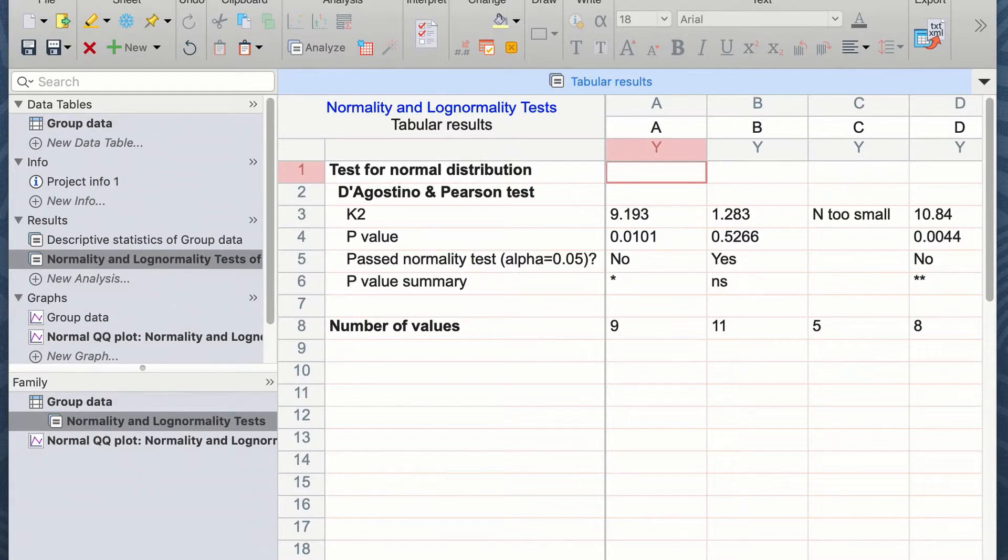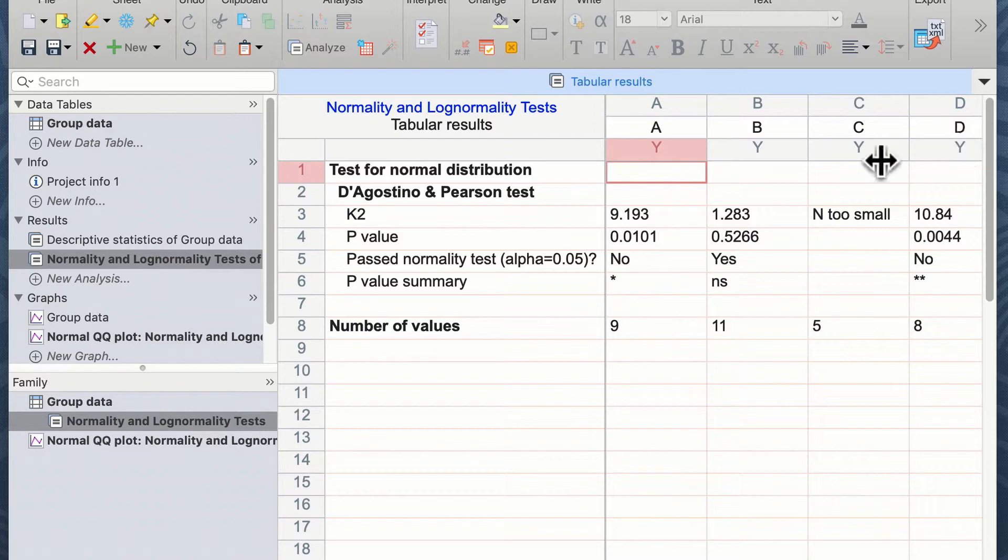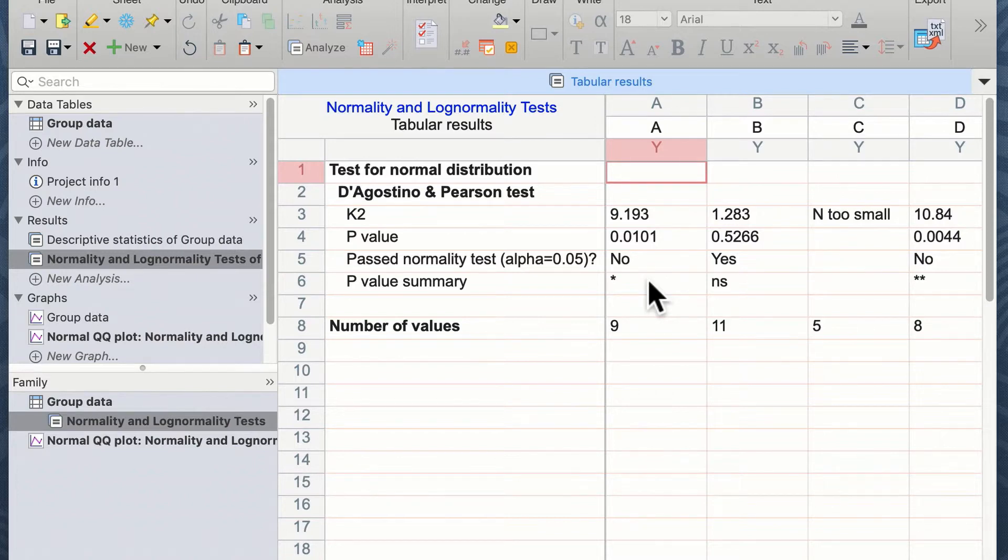The window will appear in the results section showing a normality and lognormality test results. We can see on the screen we have data from groups A, B, C, and D. The K2 value and the p-value is reported, and then the significance is given to tell us whether it passed a normality test or not.